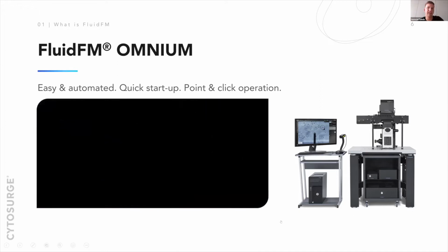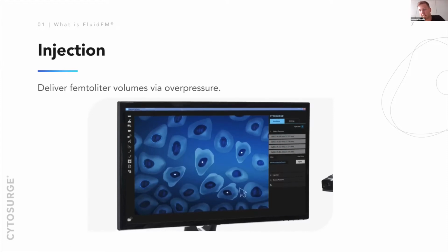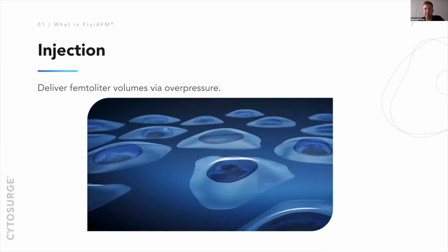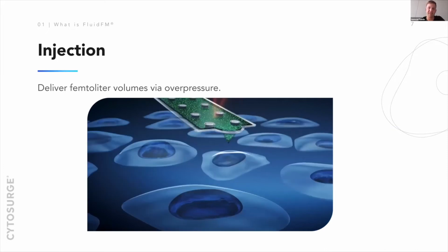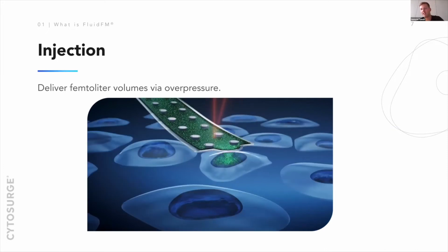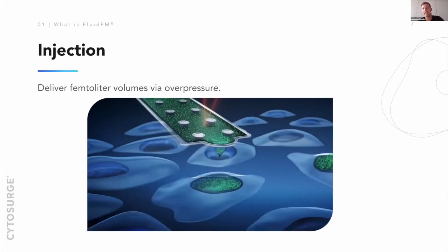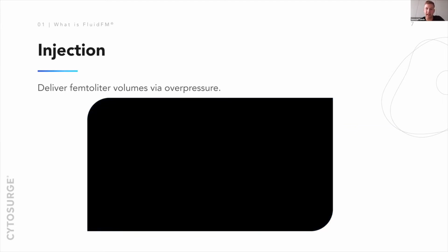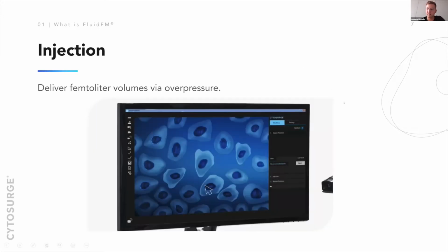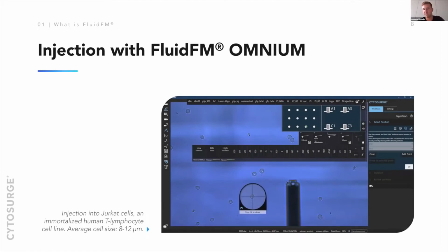So it is quite well adapted to biological environments, let's say. So I talked about injection already, when we deliver something directly into the cells. Now this can be either into the nucleus or the cytoplasm. And you can see how this is done. Well, of course, it's an artist's imagination, but this is the basic principle that we enter the cell, and with positive pressure, we deliver something. As you can see, we normally mix any liquid with a fluorescent marker just to make sure that the injection actually happens, since otherwise the viability of this whole manipulation is more than 95%. So if there is no fluorescence, then we don't necessarily see a lot happening to the cell.